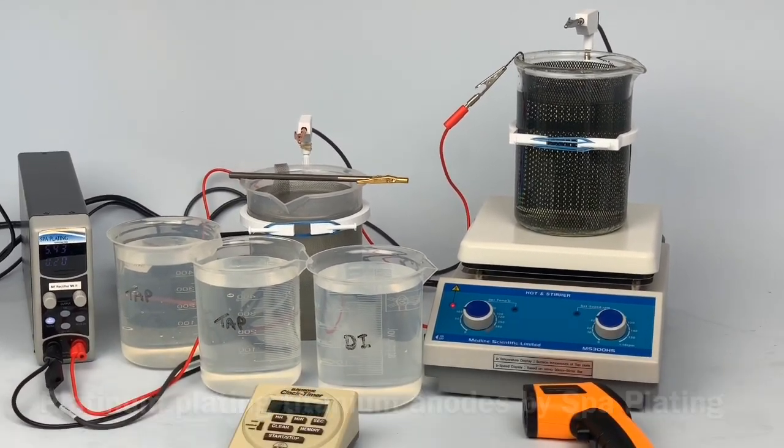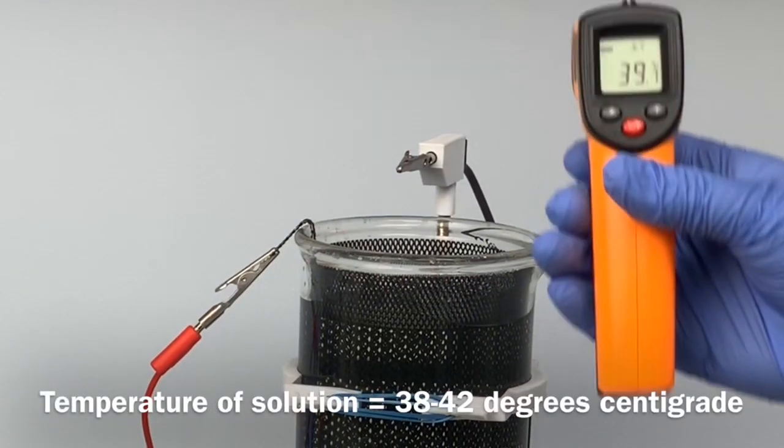Before you start, check the temperature of the platinum tank plating solution is within its operating range of 38 to 42 degrees centigrade with your temperature probe.